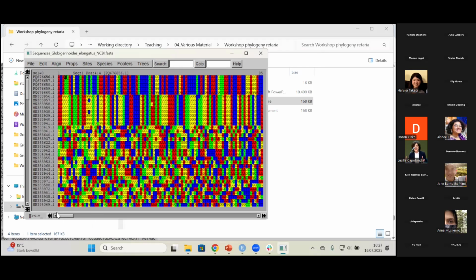And what we want to do is first select the sequences that are going to be relevant to our study. To do that, I'm going to align the sequences because it's going to allow me visually to see what belongs to the same gene and what does not. So I'm going to go on the menu called Align, that is here. This is the third, starting from the left. I'm going to click here. And then I'm just going to click on Align All.